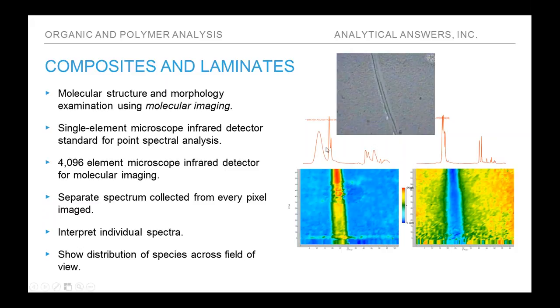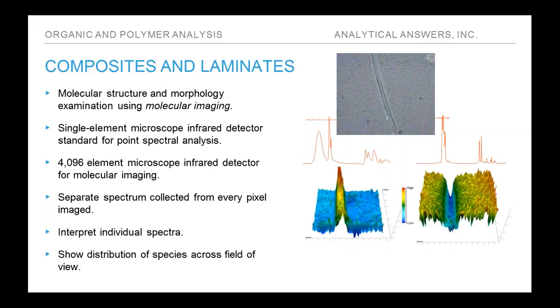So for example here, on the left side we had found the features that identified that particular component as a vinyl alcohol, and we're able to plot the intensity of that vinyl alcohol as a function of position in this false color image, as well as the other major component on either side being the polypropylene. So we're able to plot the overall response of polypropylene here in these false color images, or as this pseudo 3D image showing a band of the polyvinyl alcohol running through.